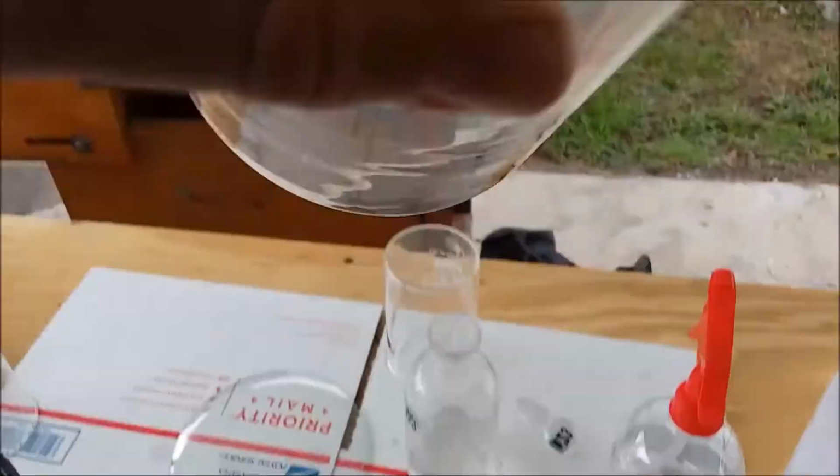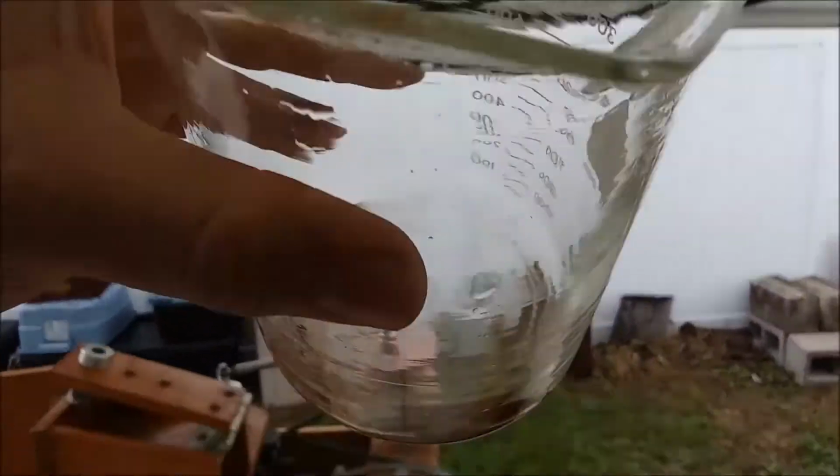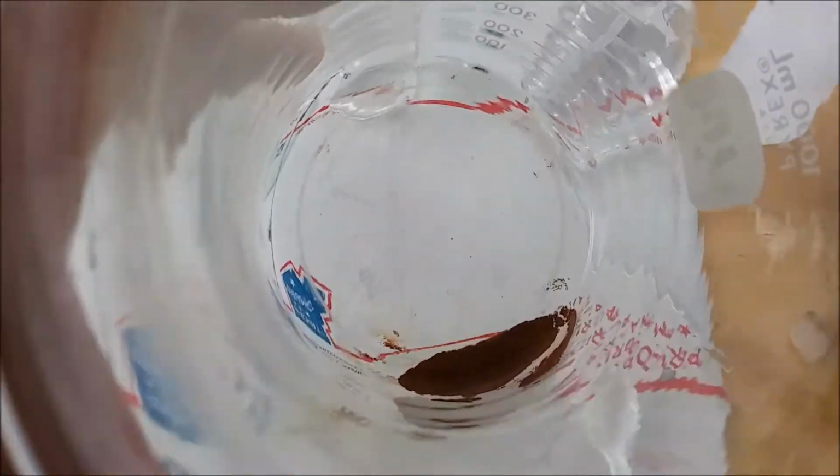I'll tell you what, this is some of the best looking gold I've ever dropped. So it seems like a pretty good quantity of it too. I mean, this is a big beaker too, and that seems like a good quantity of it down there. I may redissolve it to repurify it some more, but boy, this looks really good. I mean, it's got a nice light brown color to it. It's not as nasty looking as some of my early gold drops. So this came out nice.